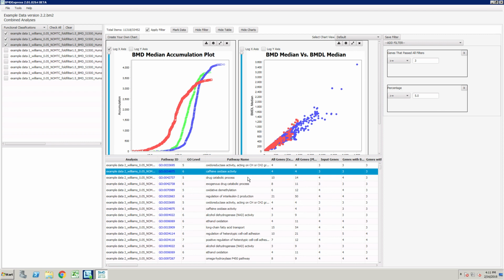So that's a quick overview of BMDExpress and how to get you going.